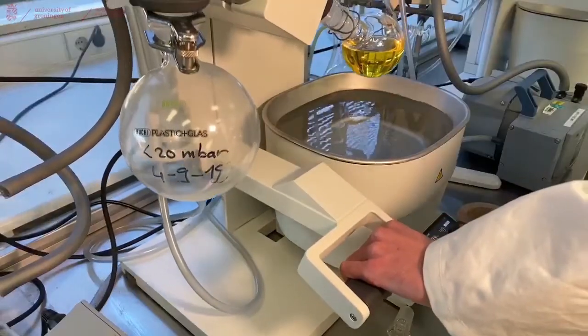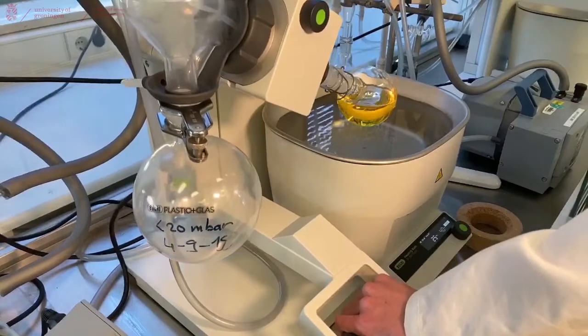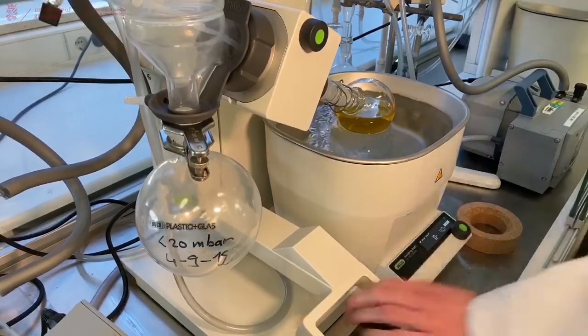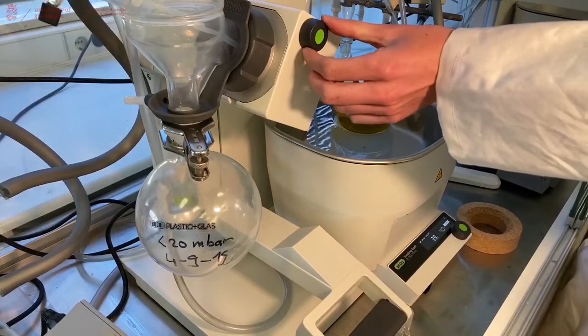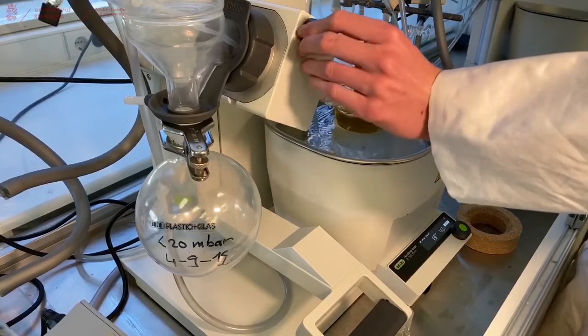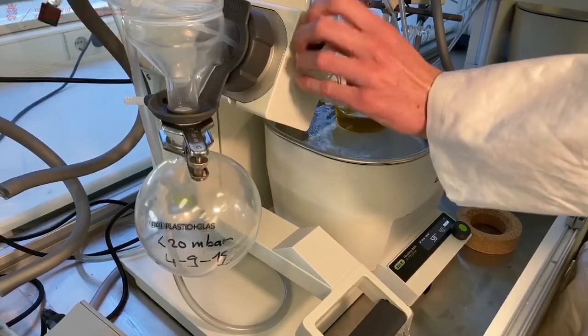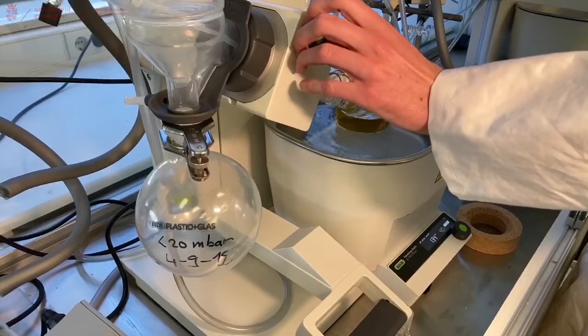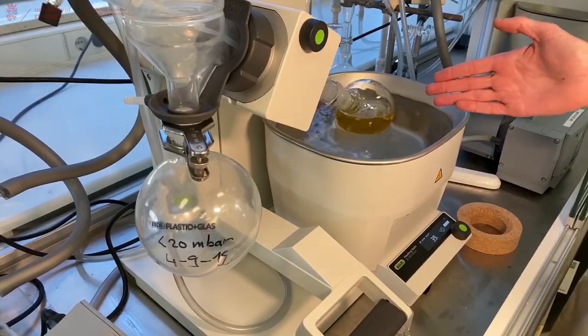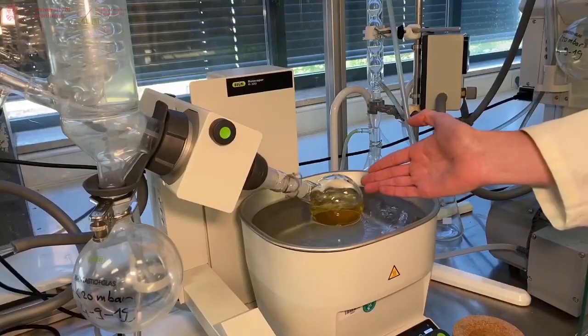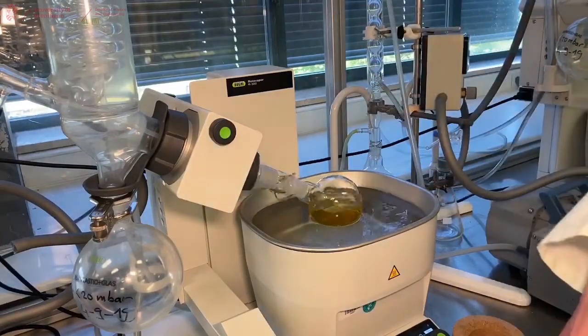Most Rotary Evaporators either have a handle, electric or manual, and lower your flask until it hits the water and turn on the rotation. Make sure that it is rotating fast enough, but not so fast that the liquid will actually go into the connector.